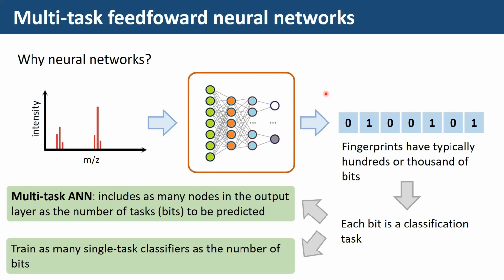Data pre-processing is often a bottleneck with LC-MS. What is your opinion? Please give some pointers to process them smoothly and efficiently. I mean, you are right, but our starting data were just the mass spectra, and we just used the mass spectra.